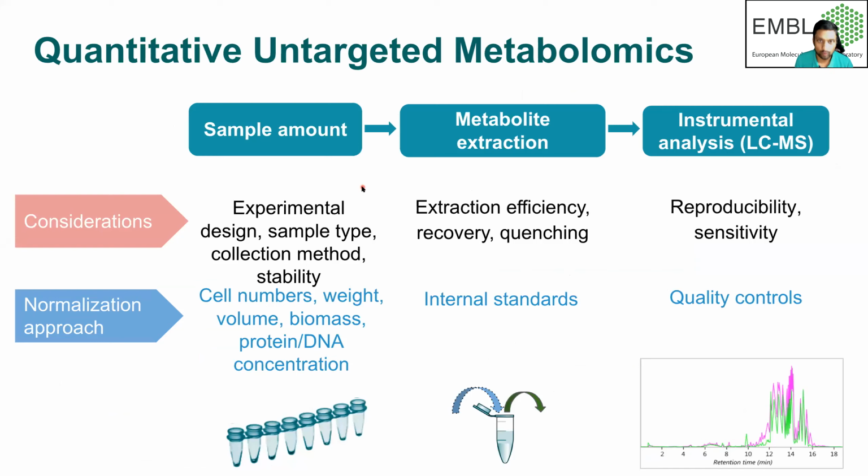I will focus more on untargeted, because targeted analysis is very clear. The more popular approach is untargeted, just because it sounds very appealing to detect thousands of metabolites, but that's not reality, which I'll show you. But what are the different aspects of the workflow which we are going to conduct? This is the broad workflow which I'm showing you here.